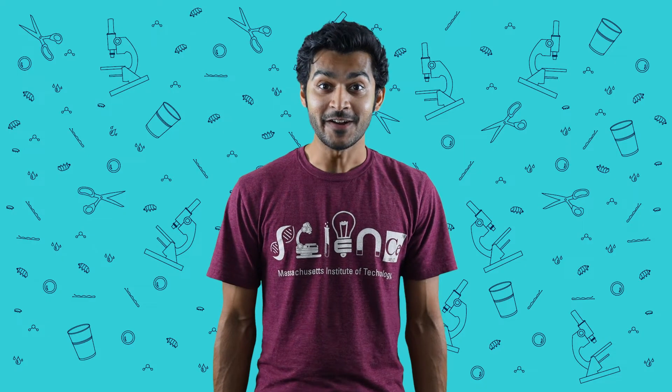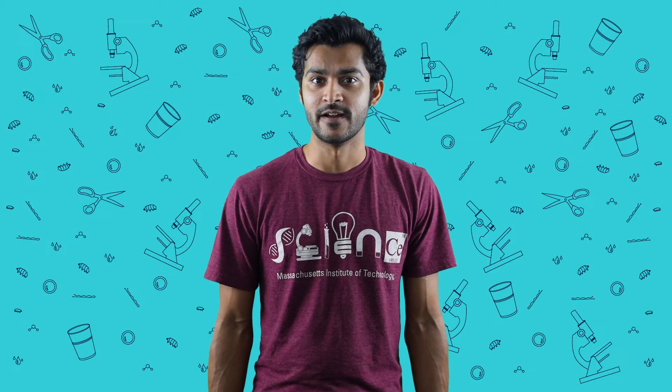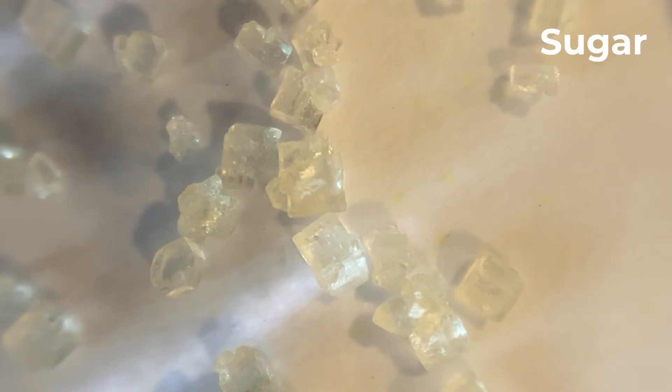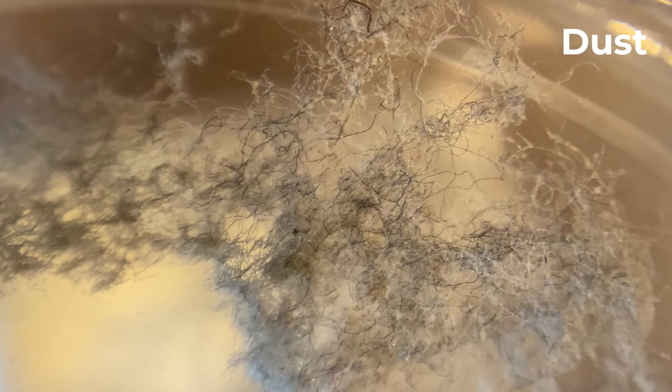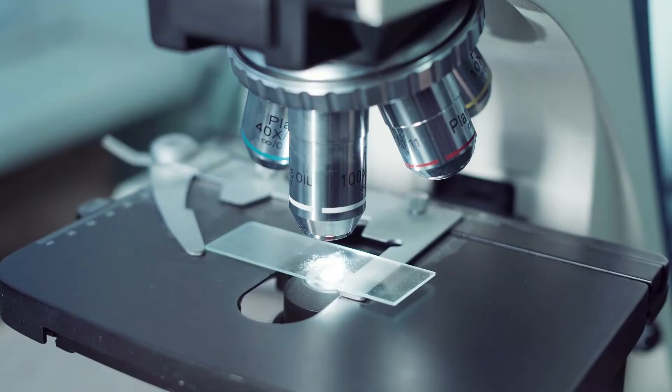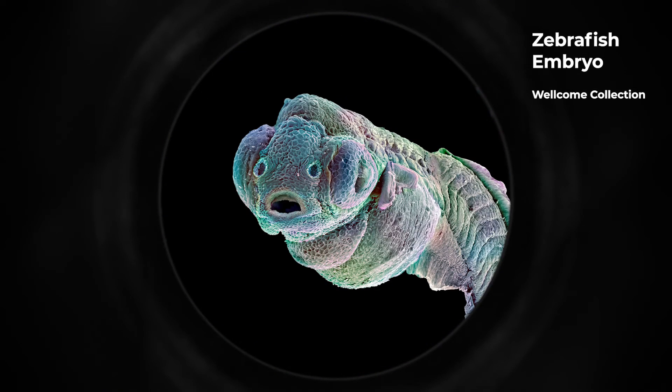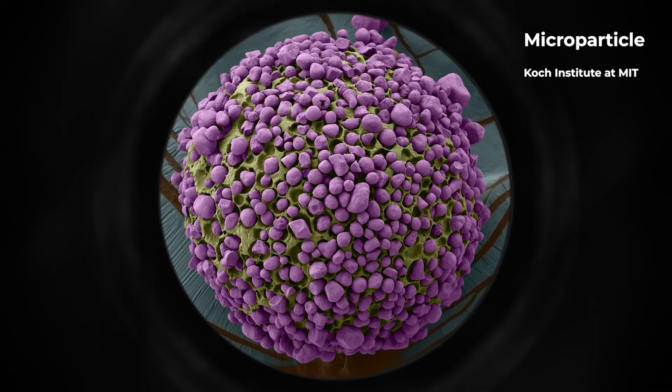Did you find one? It's okay if you didn't. But what else did you find? I found many of these creatures called rotifers along the way. What other things can you look at up close with your microscope? This invention has enabled entire fields of science to exist and has led to many life-saving discoveries.